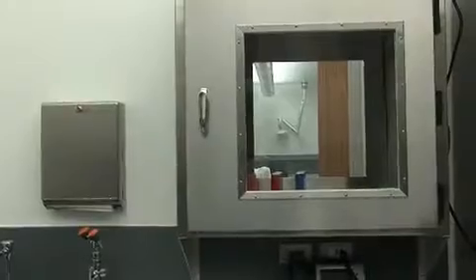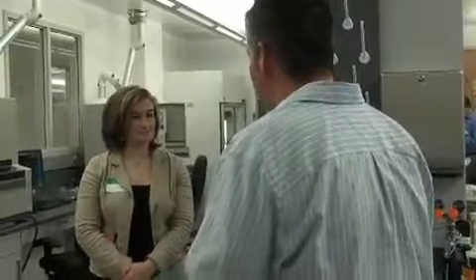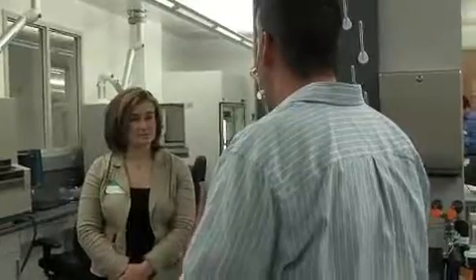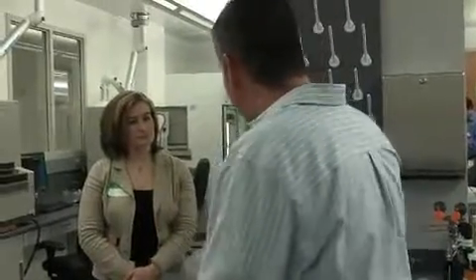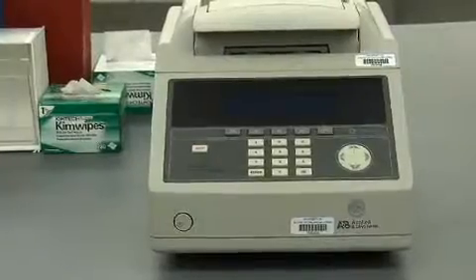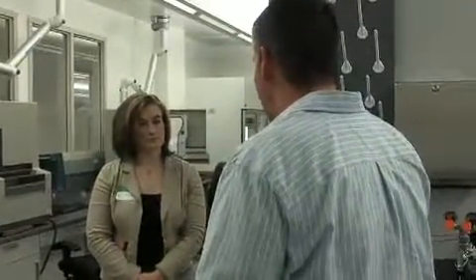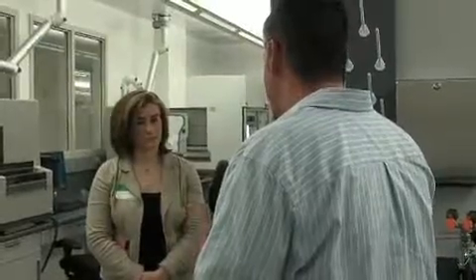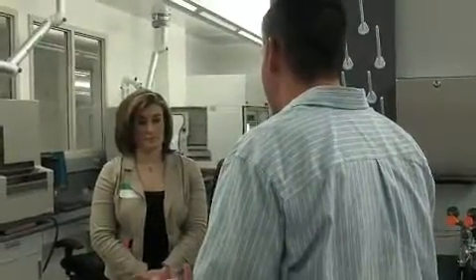So once we set up the samples in the other room and send them through the pass-through, they come to this final room. And it's called post-amp or our instrument room. Basically what happens is we'll bring the samples in, and they'll go onto the small instrument that's there to your left. It goes through different temperature ranges, takes those samples through those different temperature ranges, making copies of that DNA. So where you might start with 1 strand, it's an exponential growth over 28 cycles. You may end up with 1 million or 1 billion strands, copies of that DNA.